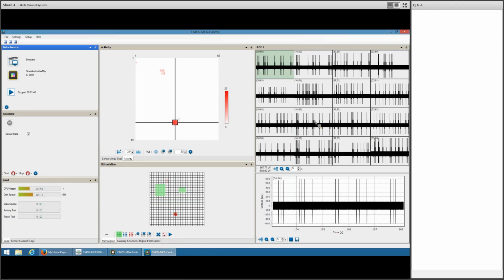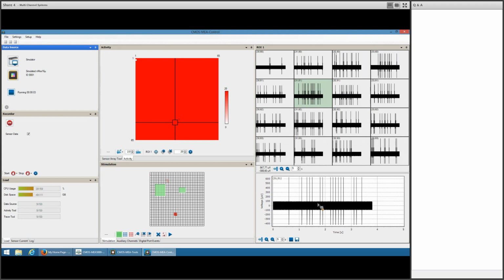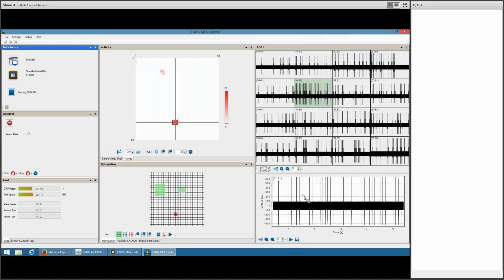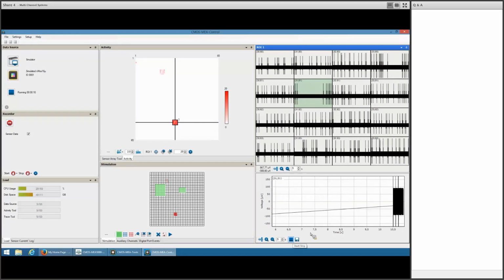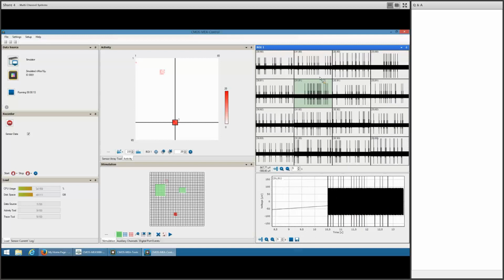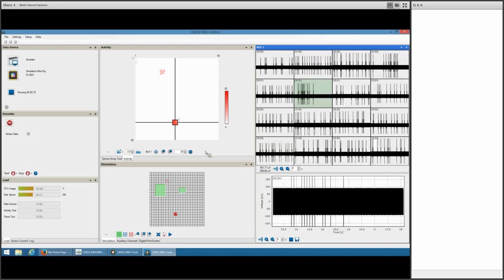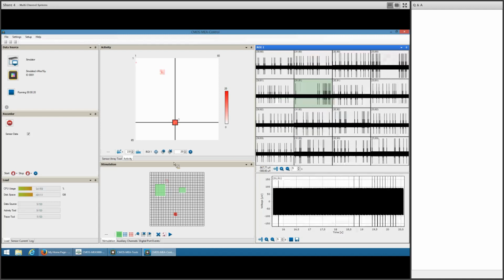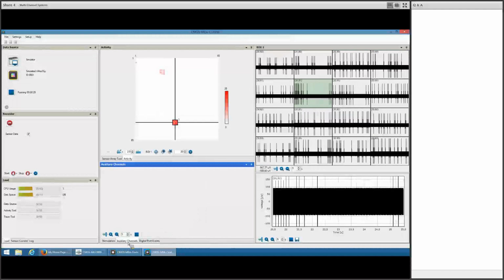Then over here, as you can see, we have the display of the raw data with the classical functions of zooming in and out, and one channel is always displayed zoomed in. You can stop that zoom and have a closer look at the data, and then resume the zoom channel while the rest is being continued undisturbed. So that's the actual options that we have now in the online recording tool.